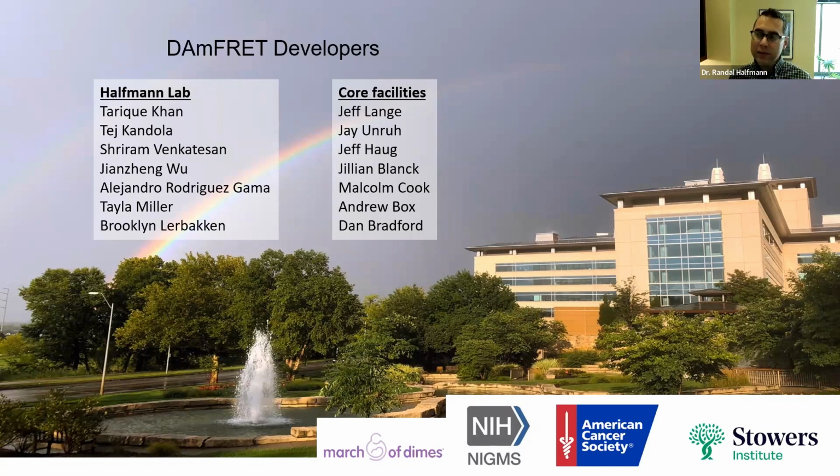And again, we can extract structural information on what is holding that species together, in a rational way based on structures that have come before us. So indirectly, we are confident about it, but we haven't tried anything else beyond imaging to try to confirm that those species are there. Good question.